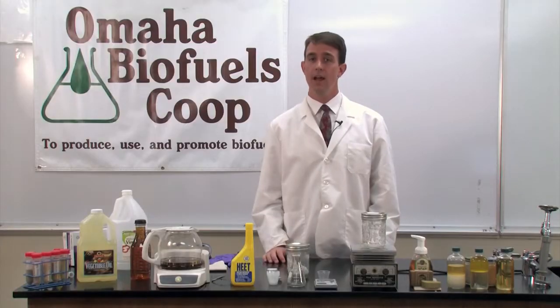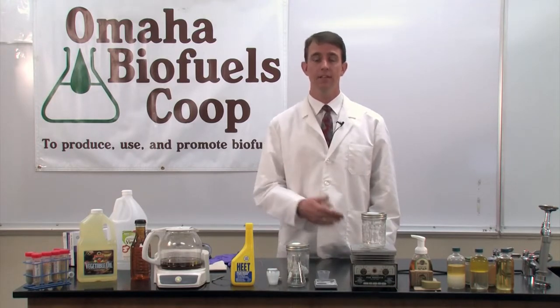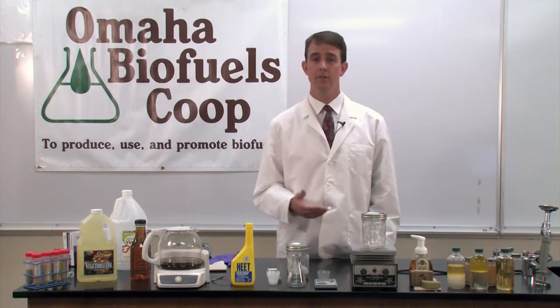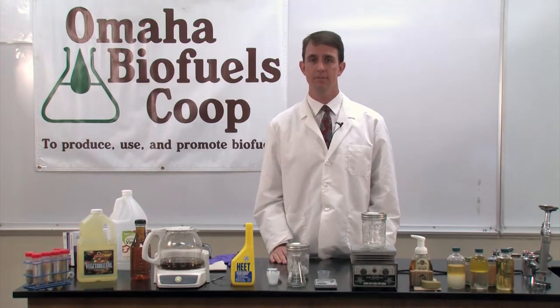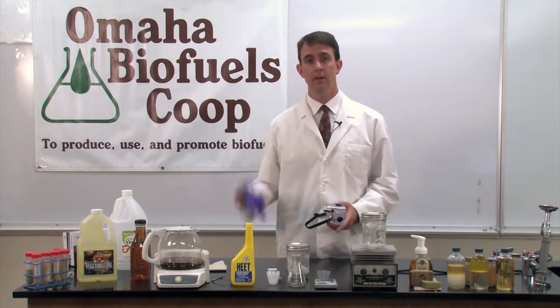Both methanol and lye should be used with appropriate precaution, including personal protective equipment. Methanol is volatile, flammable, and toxic with contact on skin. Lye is highly caustic, dissolves many materials, and also produces chemical burns immediately on contact with skin. I'll be wearing a long sleeve lab coat, goggles, and laboratory gloves.